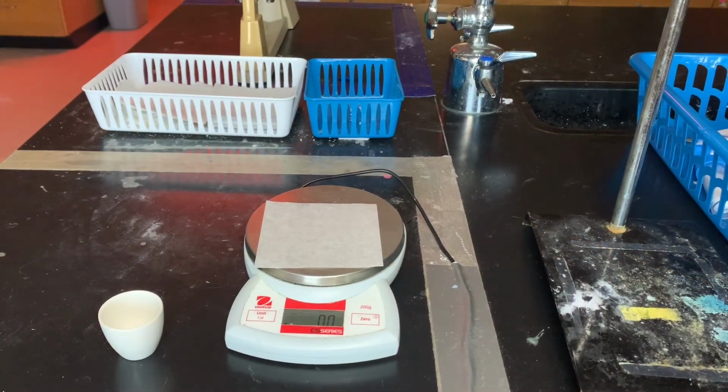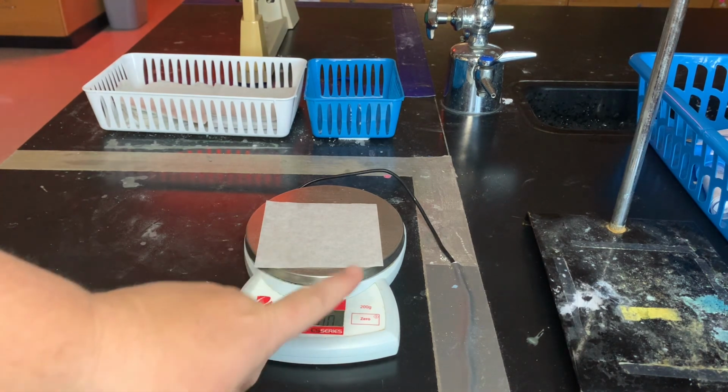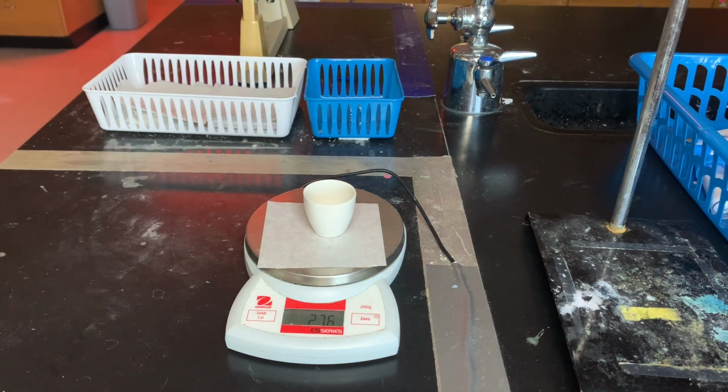So the long part will probably be you having to let this cool down because it's going to be very hot. I would encourage you not to burn yourself with it. Okay? Allow it to cool. Once it is cool enough that you can touch without burning yourself, put your weighing paper back on the scale, zero it out, and place it on there. Record what you have.